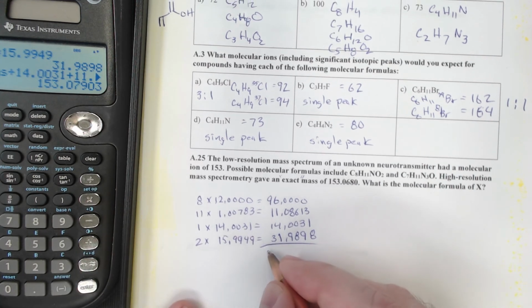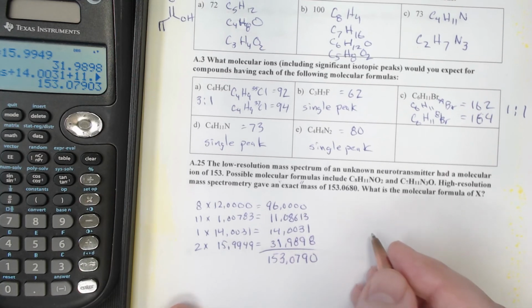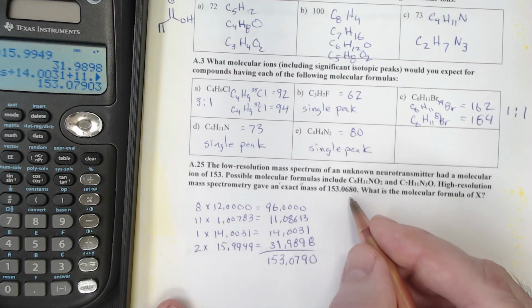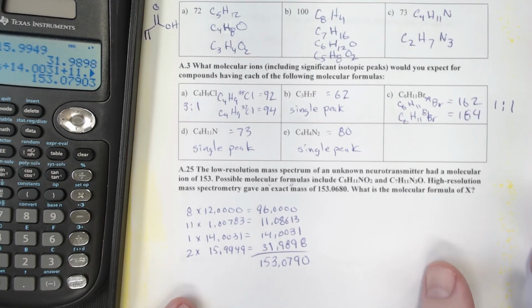The number that we get, going out to the fourth decimal point, is 153.0790. We'll see that's pretty close. That may be it. The numbers here are often not perfect, because the calibration isn't always exact. Usually the calibration is within about 15 or 20 parts per million.